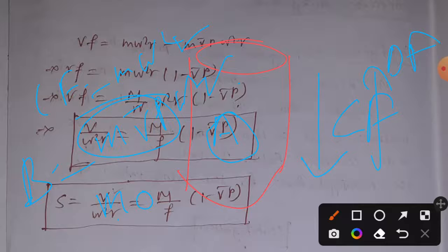Now this centrifugal force and buoyancy force together generate a net force, which is the centrifugal force minus the buoyancy force. If that is positive, the particle will move towards the bottom, and if buoyancy force is higher, the particle will not move. So this net force is the force driving the molecule towards the bottom.